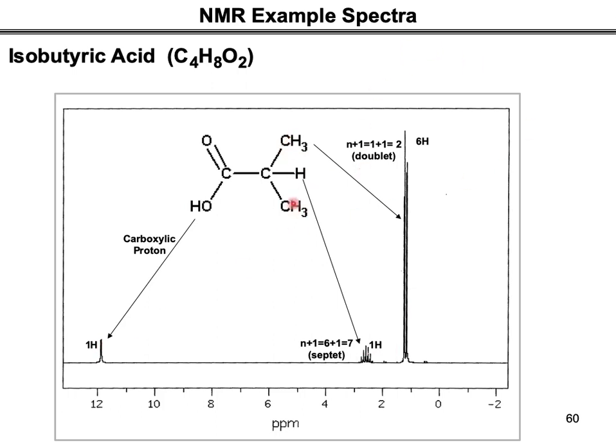These two methyls are connected with a carbon which has a carbonyl group on the adjacent carbon, but these two methyl groups are not connected with any inductive group or electronegative atom. So this one is the most shielded one.